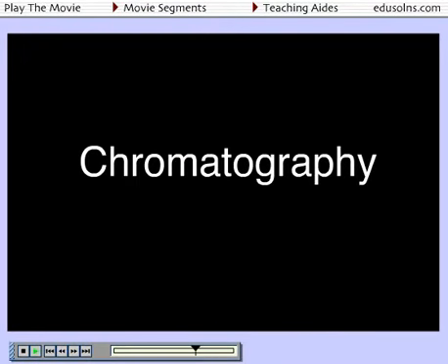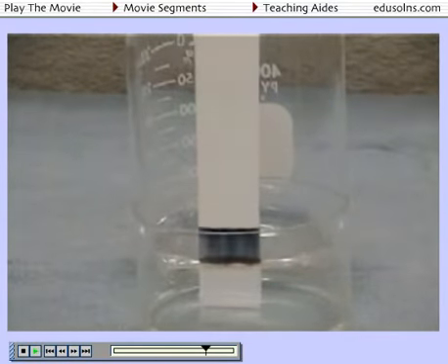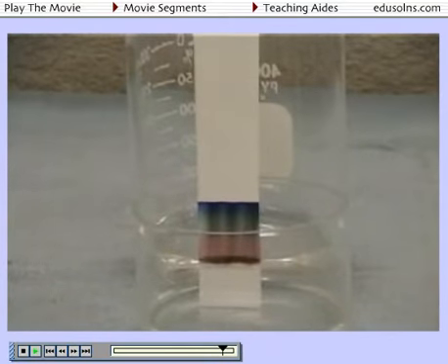The answer to these questions is chromatography. Chromatography is a two-part process. First, the complex mixture of chemicals must be separated into individual constituents. Next, each chemical must be detected. A simple illustration is the separation of black ink by thin layer chromatography. Here, the separation process results from attractions between the cellulose fibers and the different ink compounds.